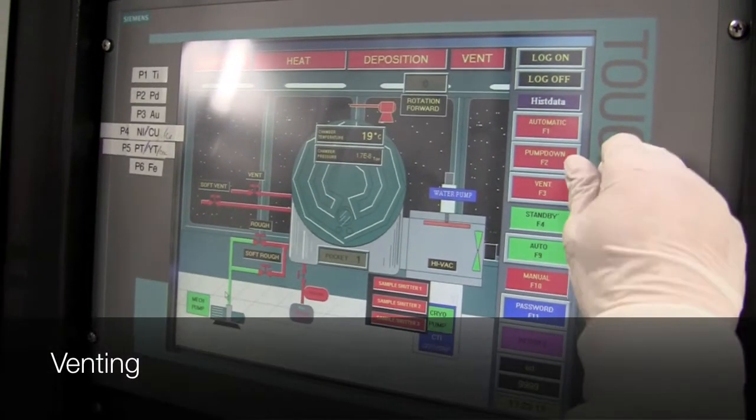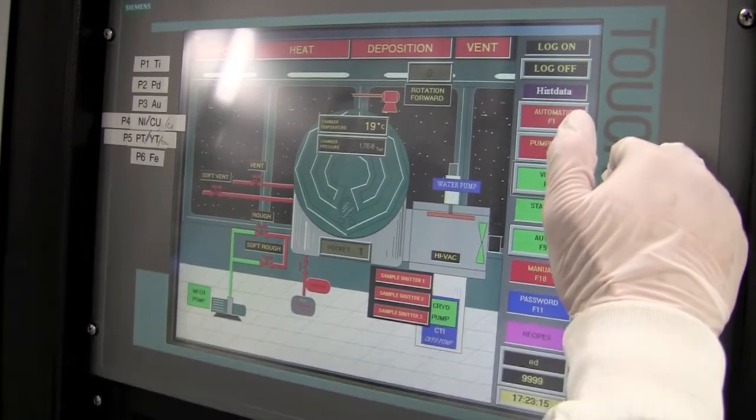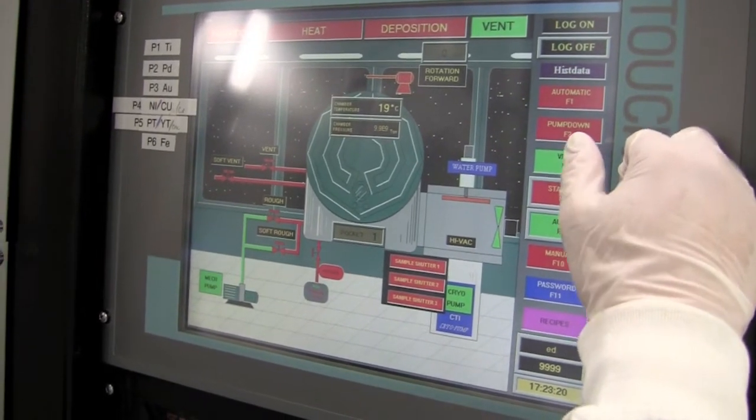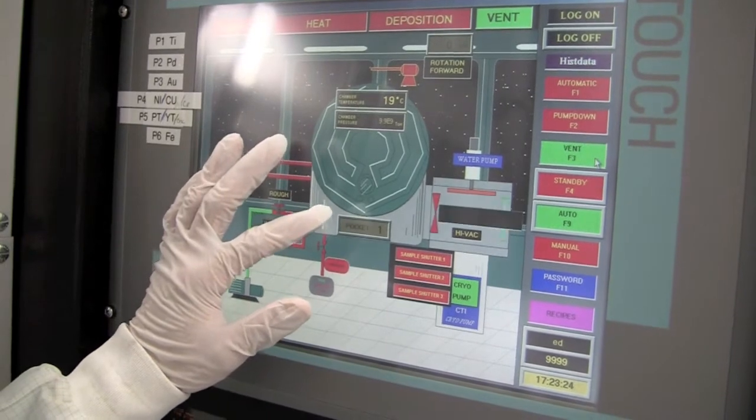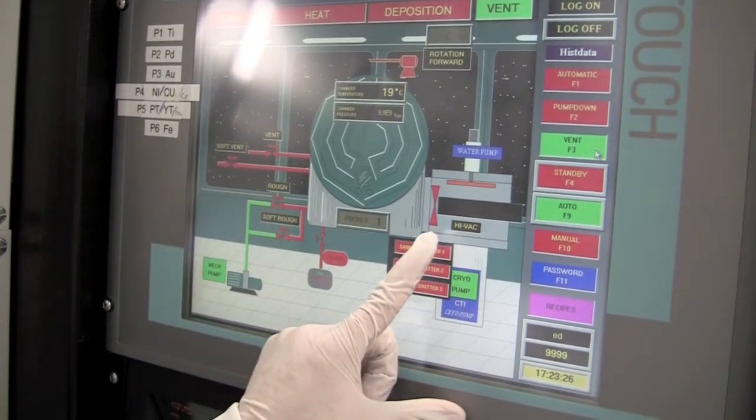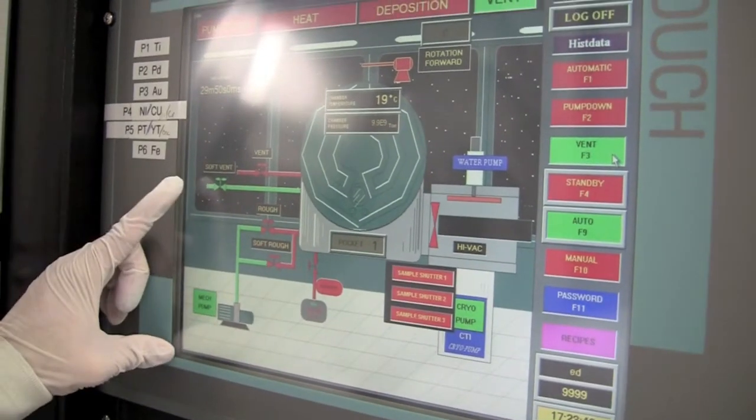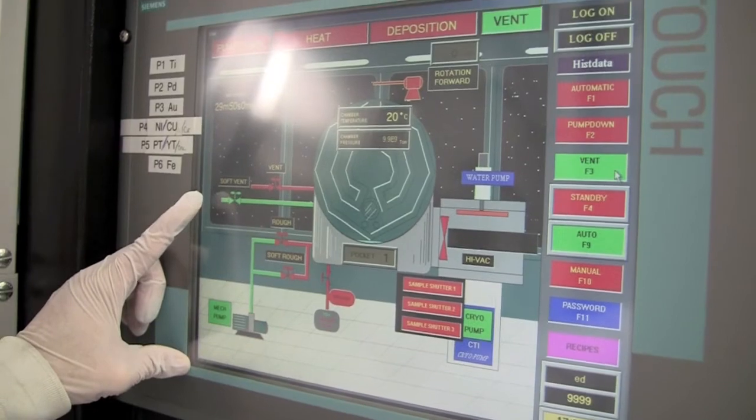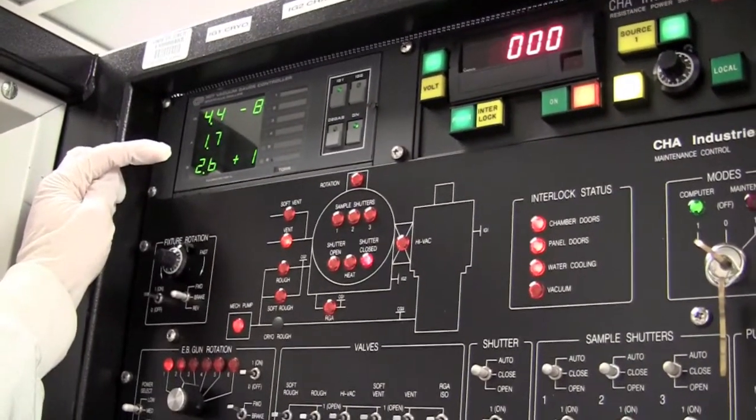We are now ready to vent the chamber and I'll do that by pushing vent. You can see that after I push vent the GUI will start showing an animation of gas going into the chamber. We can also see that the high vac is now closed. We can see that the soft vent has turned on. And we can verify that the chamber pressure is starting to rise.